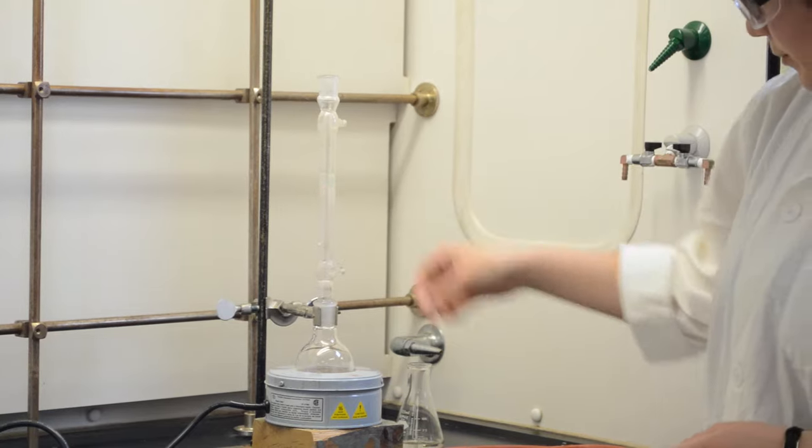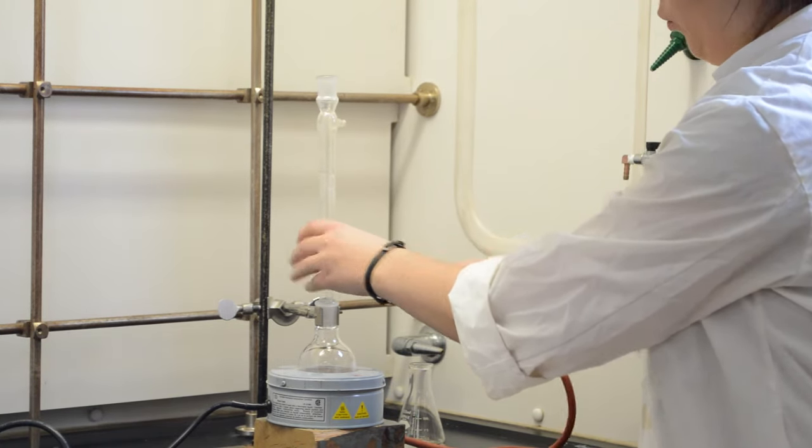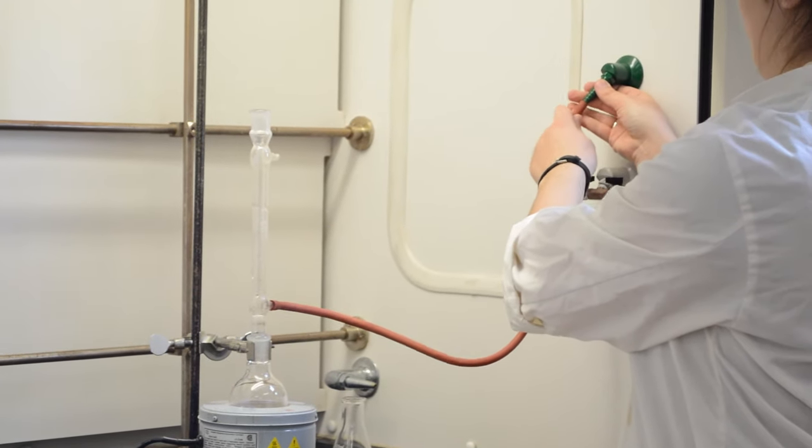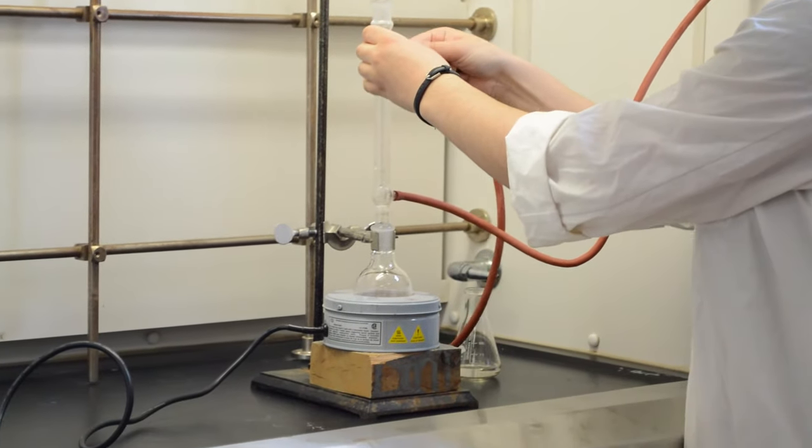Next, the cold water condenser is placed on top of the ground glass flask, and the water inlet is attached to the bottom of the condenser. The drain is attached to the top of the condenser.